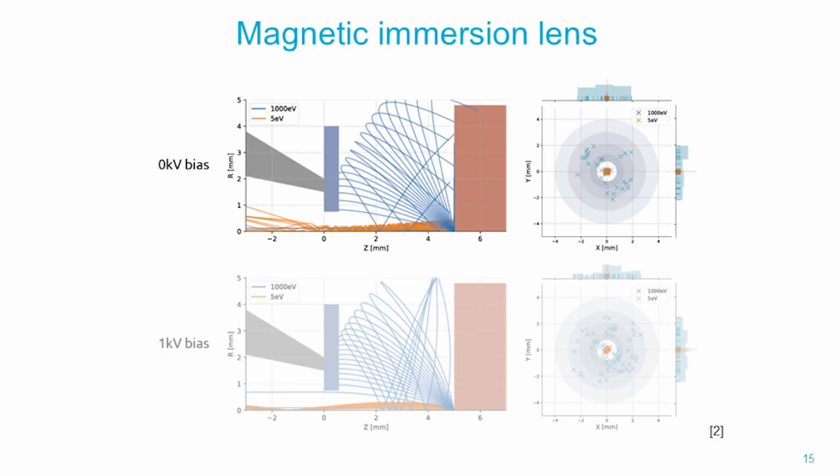So like I already said, besides electrostatic immersion, we can also have magnetic immersion. Actually, magnetic immersion occurs a lot, both in scanning electron microscopy, but typically in transmission electron microscopy. The sample is positioned in the objective lens of a transmission electron microscope, so it is in a magnetic immersion field. Now, if we recall from electrodynamics, the Lorentz force acting on an electron actually leads to a spiraling path, which is also what we see happening here.